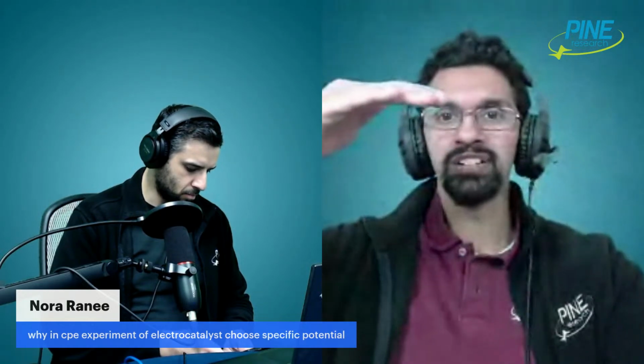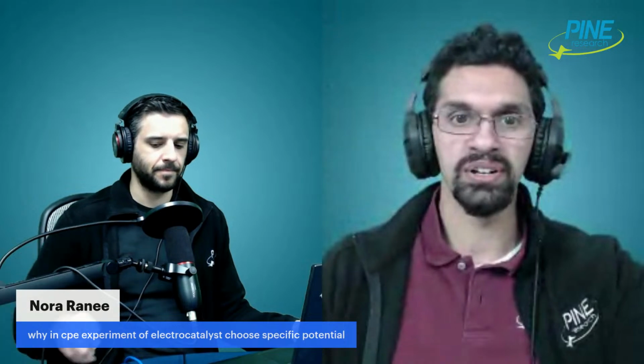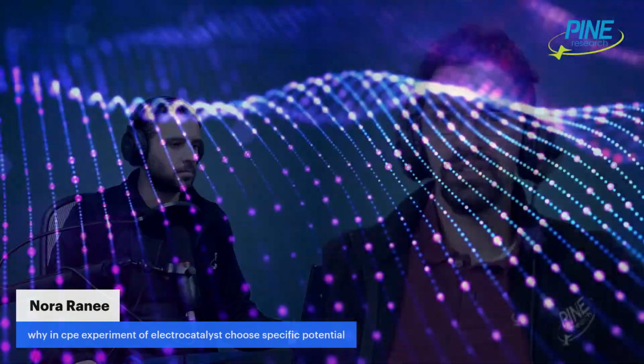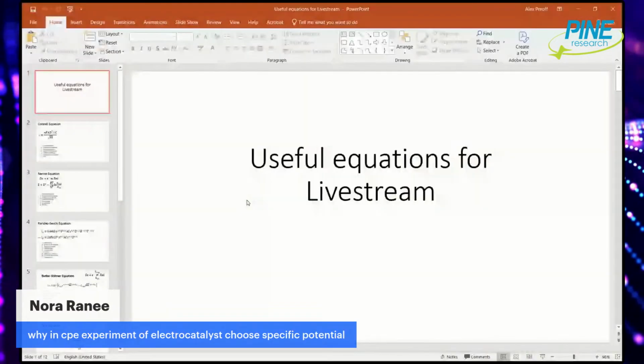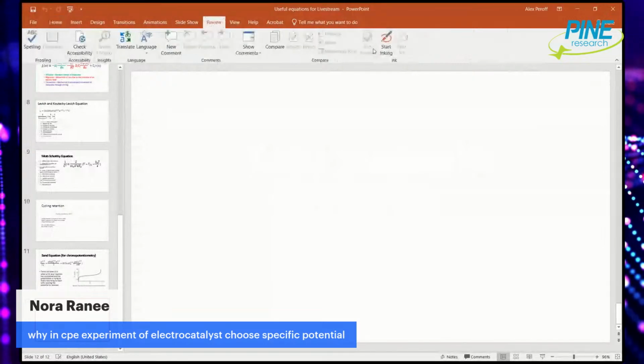So typically, in constant potential electrolysis, you're stepping the potential of your electrochemical system to some potential where ideally you are oxidizing or reducing your catalyst and having a reaction occur. And so you need to choose a potential at which that happens. So I'm going to share my screen very quickly to show you, generally speaking, what we're talking about.